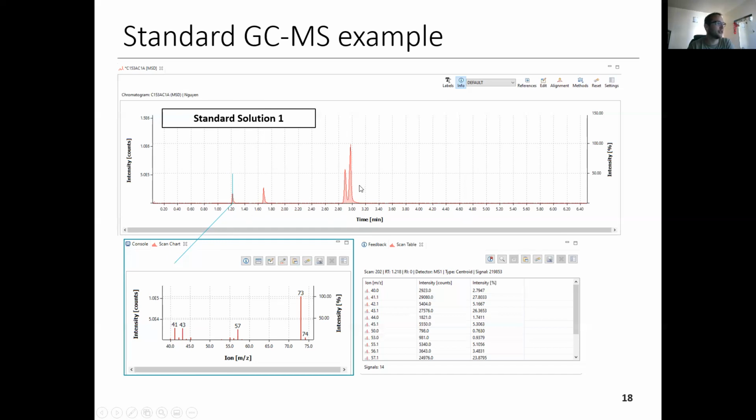We've got 4 different signals, and hopefully each one of those corresponds to different ions that correspond again to our actual analytes. So for this one, I selected the scan that's just right at the peak of this signal here. And we can see that the dominant component there is this mass value of 73. So it's a pretty fair bet that this is the MTBE from our solution.